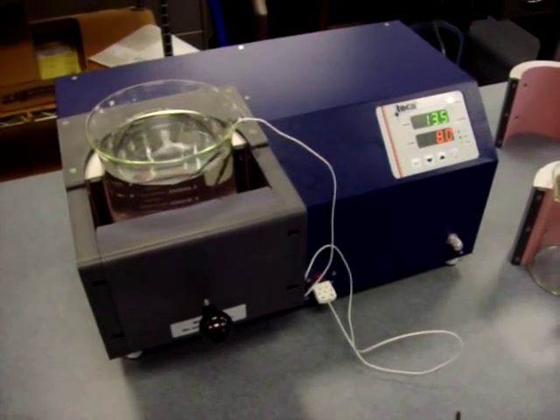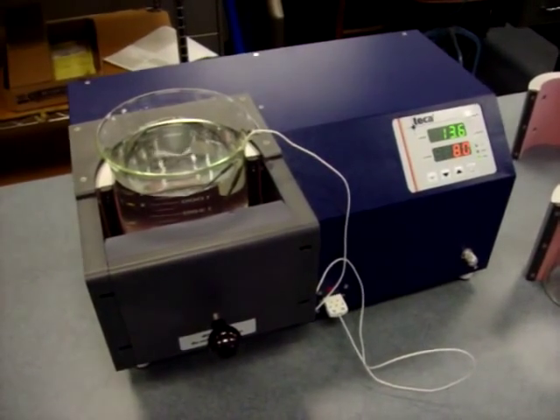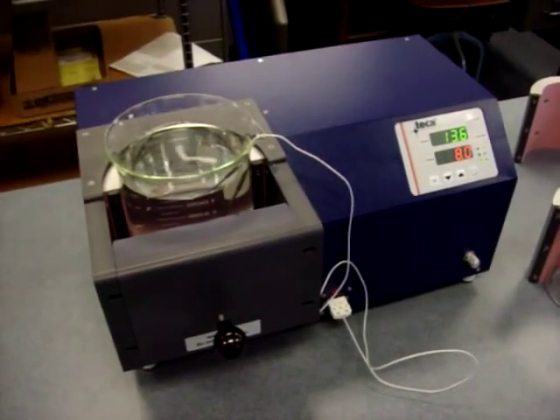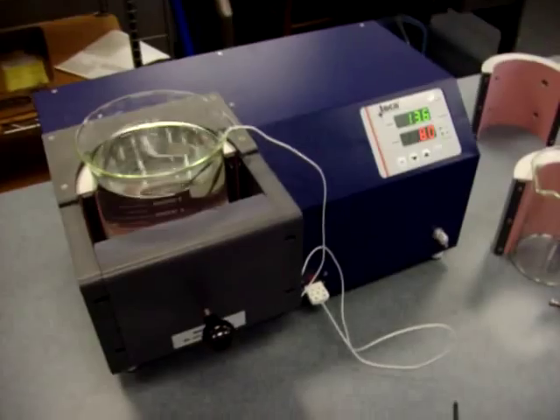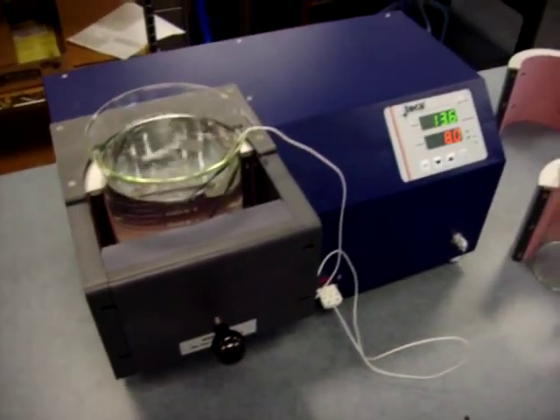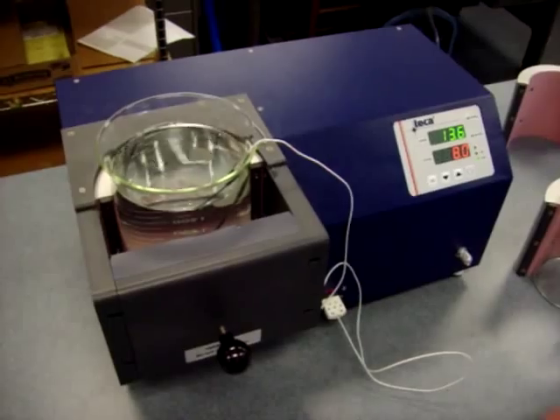Hello everyone. Andy is going to show us the new Teca model AHP 800 MSP magnetic stirring cold and hot plate. Here's the 800 MSP cooling a 2,000 milliliter beaker right now.